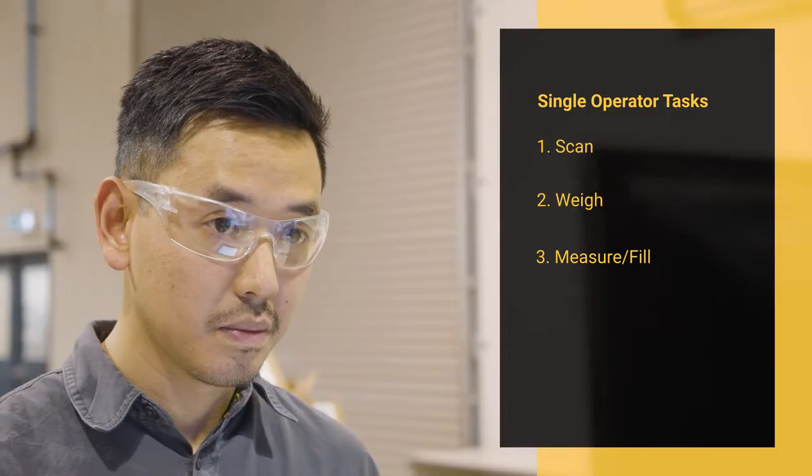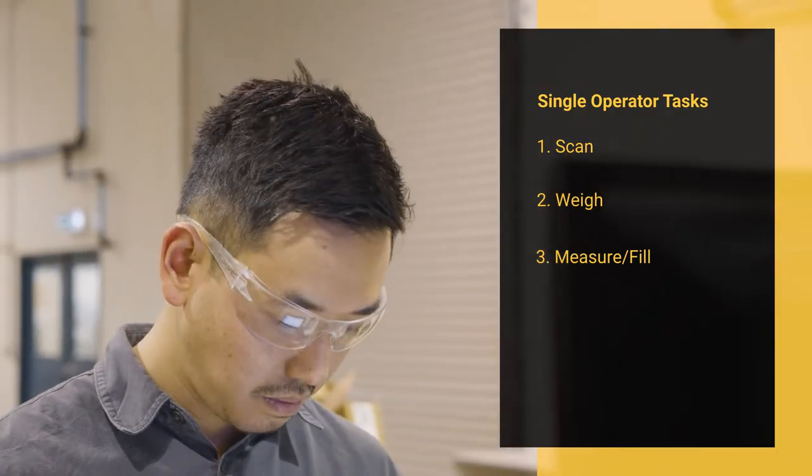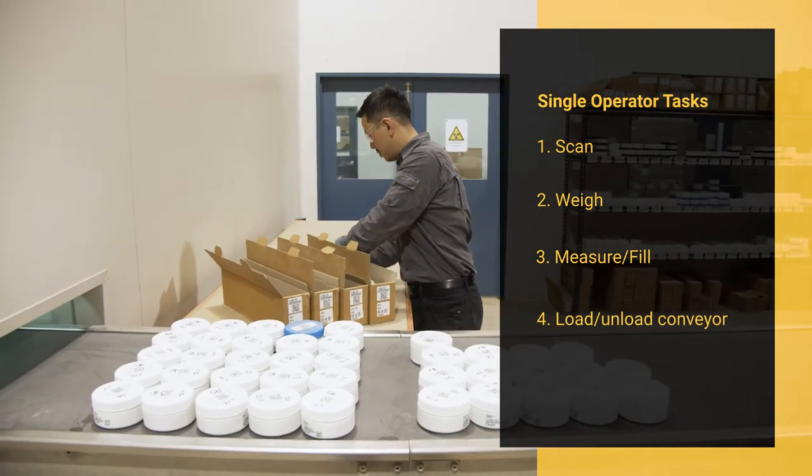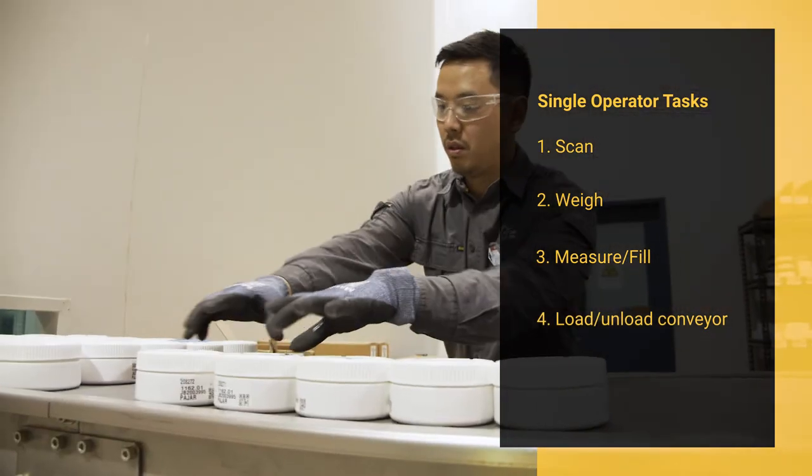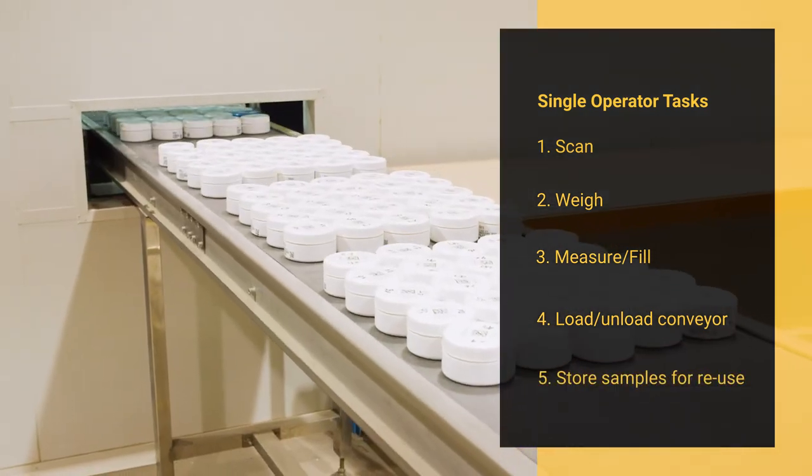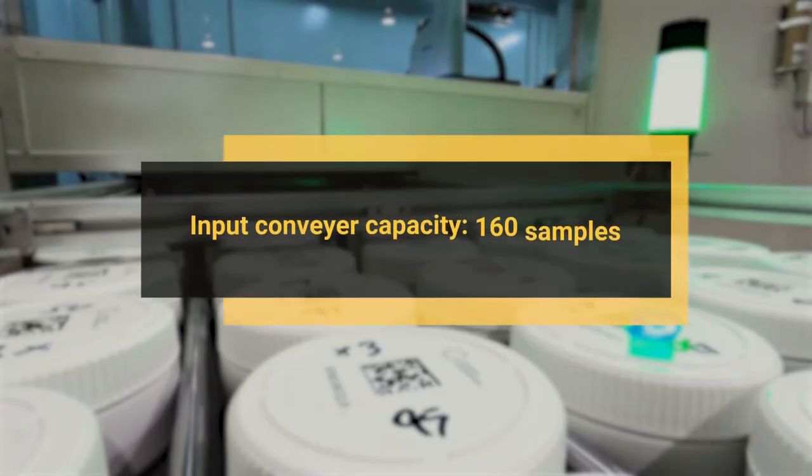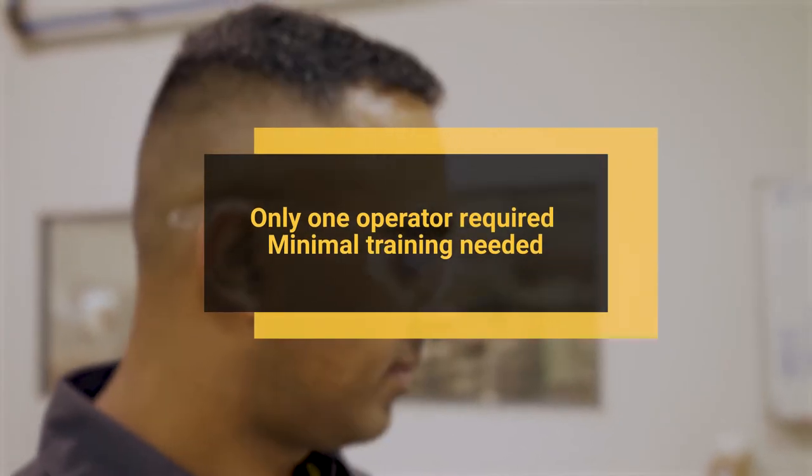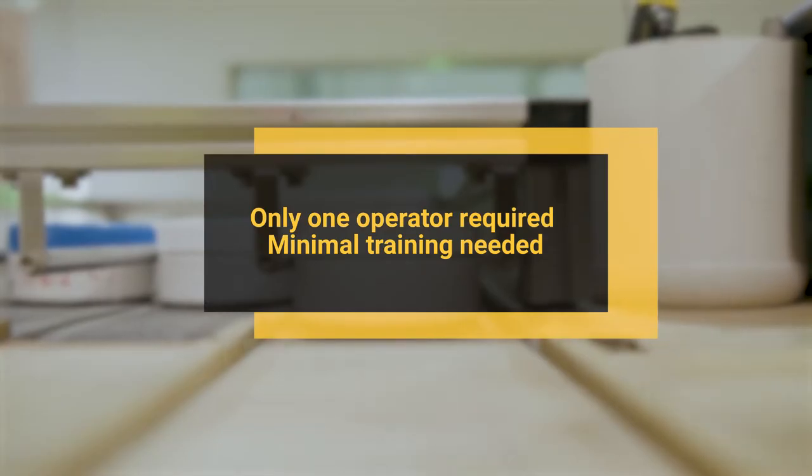During normal operations, the photon assay unit runs fully automatically and requires no intervention beyond a single operator loading and unloading samples onto the input and output conveyors. The input conveyor itself has a capacity of 160 samples. Additional samples may be added by the sole operator at any time when the system is running.